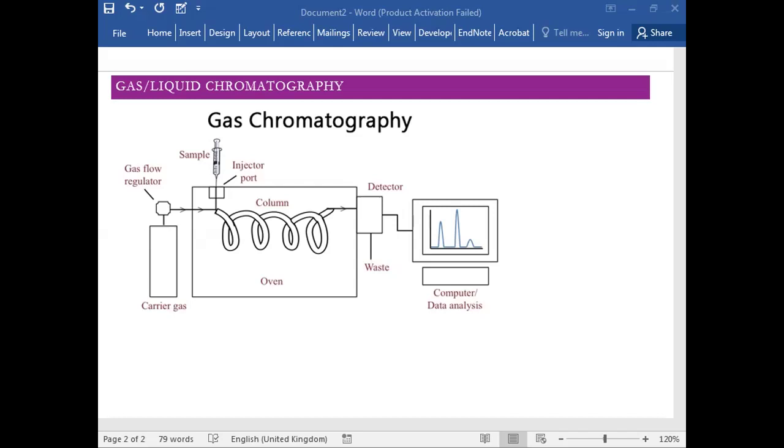Stationary phase क्या है? Be very clear with this. You have a non-polar liquid. So the more non-polar your component is, the more sticky it will be to the stationary phase. What other reason can you have that your component takes longer to reach the detector, apart from just being sticky?